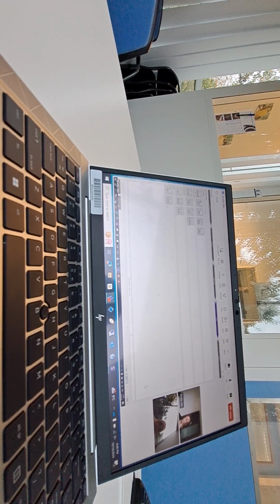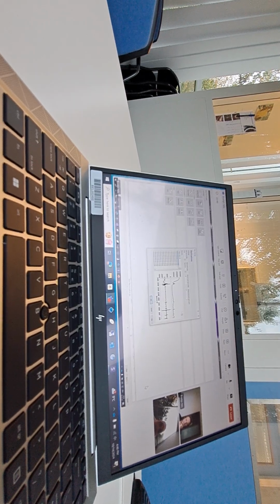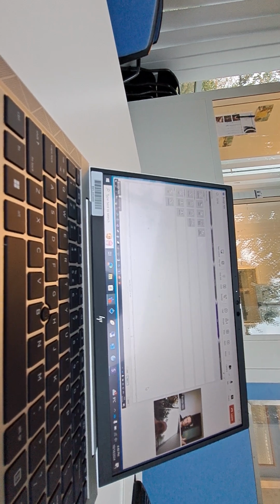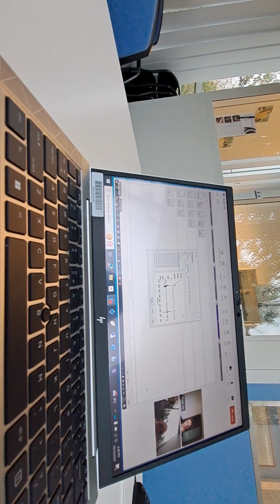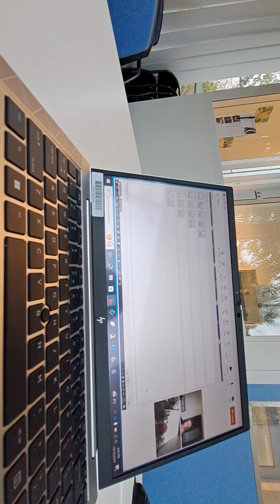And a combination that I use a lot is a derivative plus a SNV. It's important to first do the derivative and then the SNV, because the other way around is also correct, but it's more frequently done if you first do a derivative and then a SNV. Here you see one, it will first do the derivative and then it will do an SNV on it.